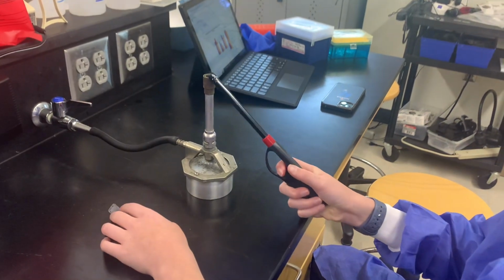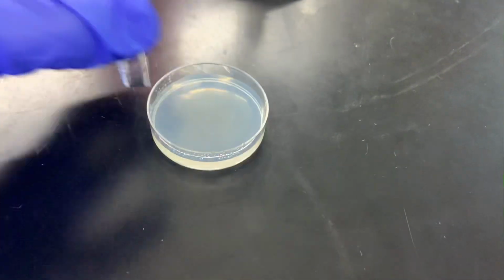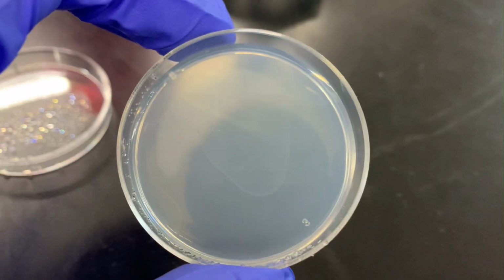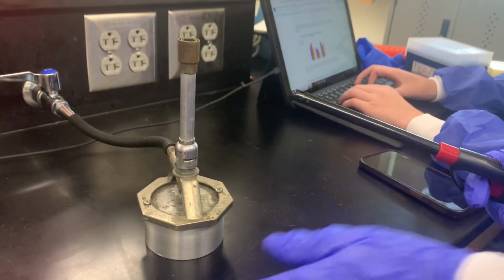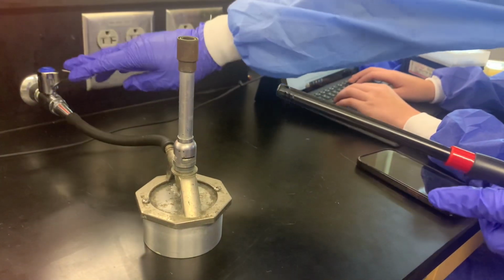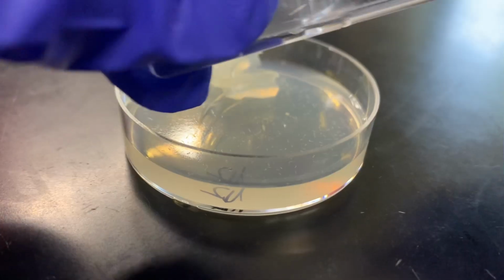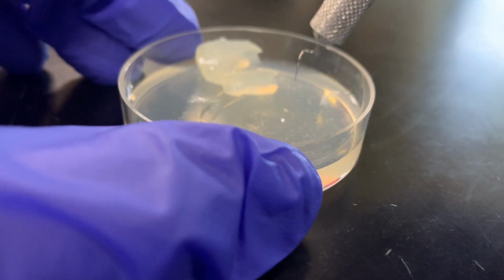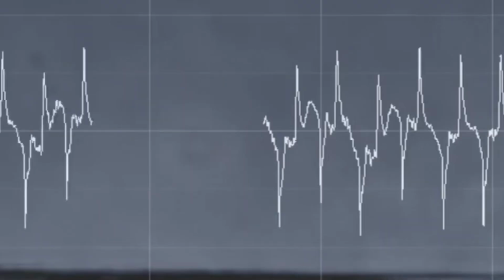Last but not least, we have to examine the worm's behavior with respect to their swallowing capability. Worms prefer to eat a species of bacteria known as E. coli, so here's a plate, and we decided to observe individual worms instead of a whole batch, so we had to use a tool called a worm pick that is made out of platinum. First, we sterilize the pick by using a Bunsen burner and a lighter. Afterwards, I'm able to start picking the worms from one plate to the next, which is always difficult to some extent. The interesting thing is that C. elegans can pump its pharynx up to 300 times a minute, which is characterized by this twitching behavior.